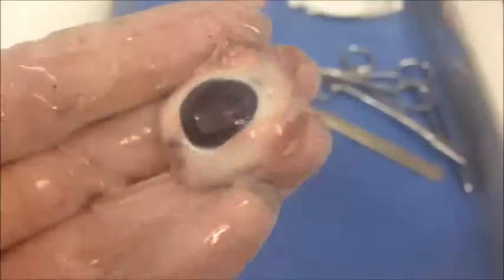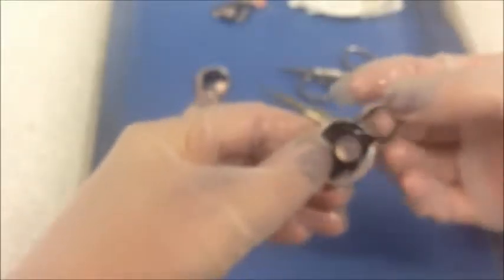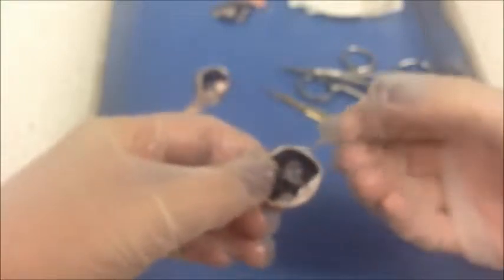I am now showing you the front of the eye again. The hole in the front of the eye is called the pupil. This is where the light enters the eye. The dark circle surrounding the pupil is called the iris. The clear layer covering these two structures is called the cornea.